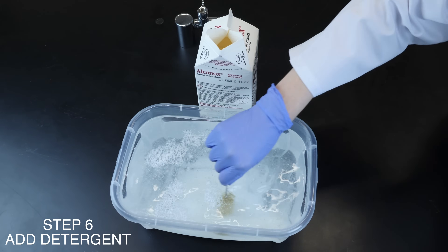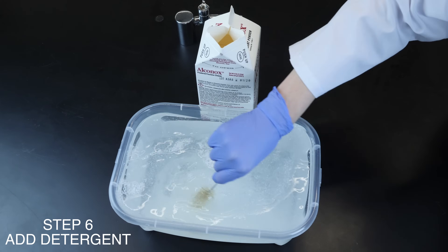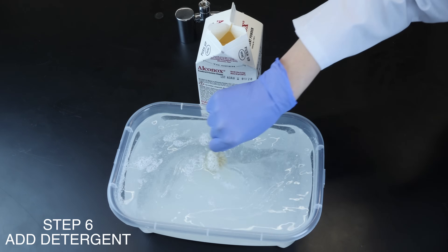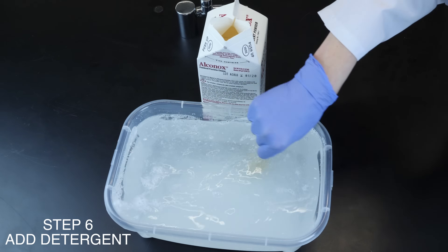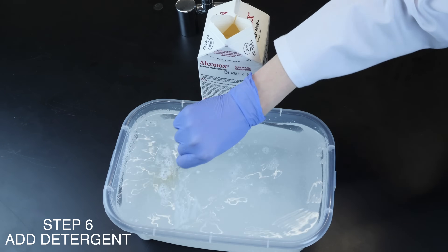Use high foam for manual soak and ultrasonic cleaning. For ultratrace analytical glassware cleaning, a little more precision is needed. Measure the 1% solution reasonably accurately so as not to use too much detergent.